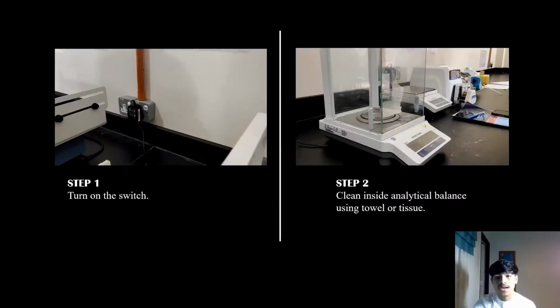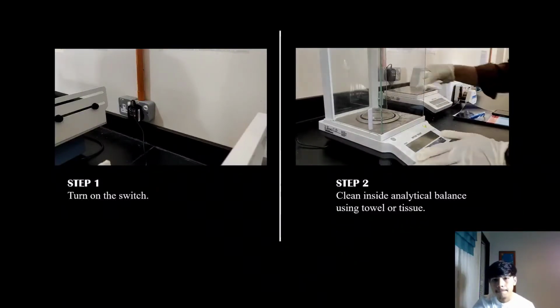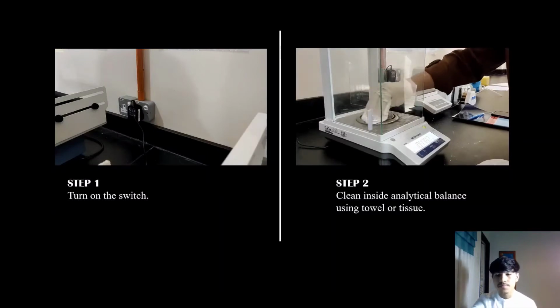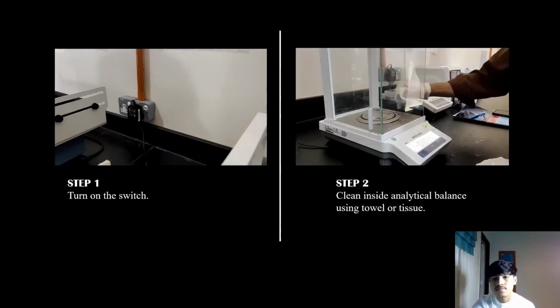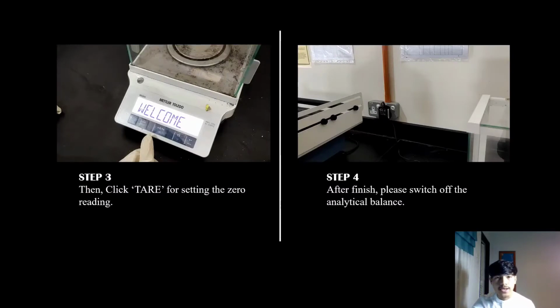Second step, clean inside the analytical balance using towel or tissue. Step 3.